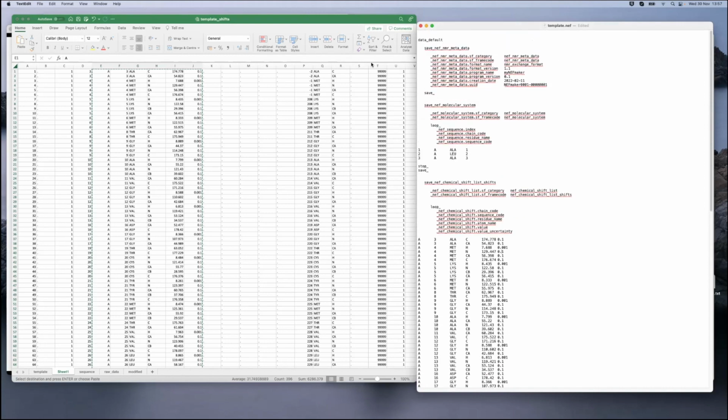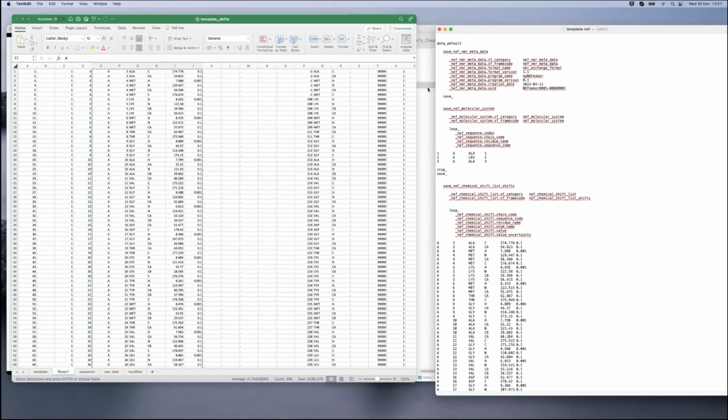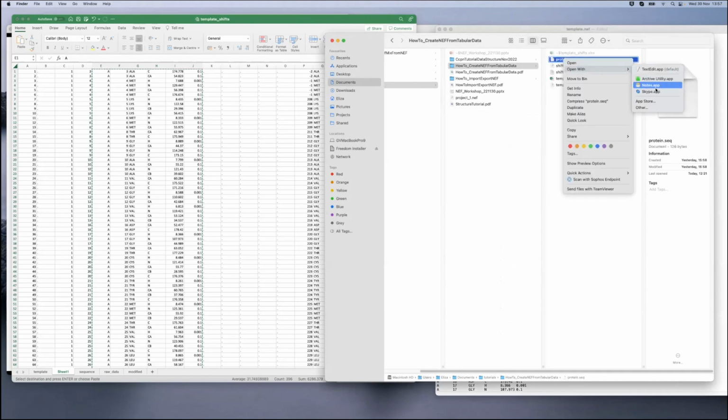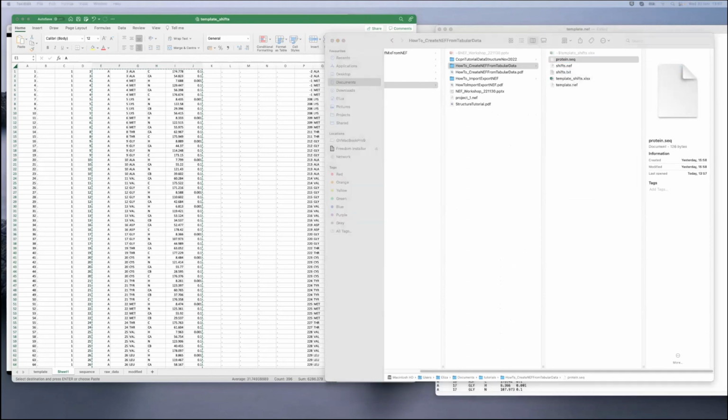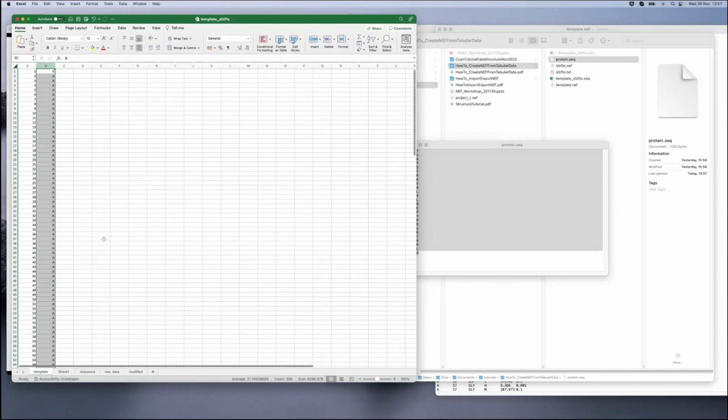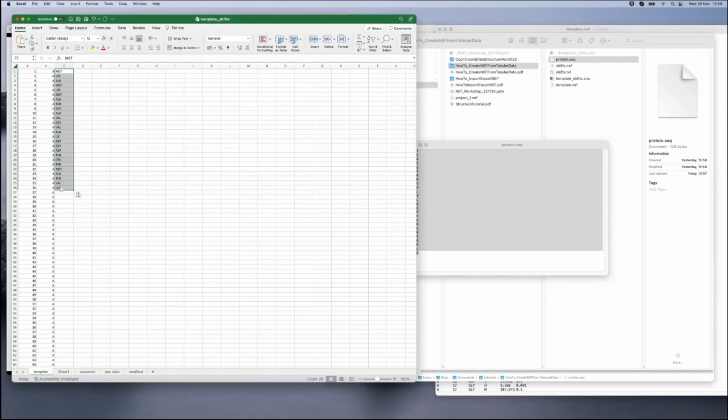Now we have to make sure we have our molecular system as well in here. The user sent me also the sequence of that section. So now it's conveniently already in one column. If you don't have it, you can easily convert it. There are lots of tools available online to make it like that. So the easiest way, again, I have my template ready because I've done it a number of times, and I just copy it here.